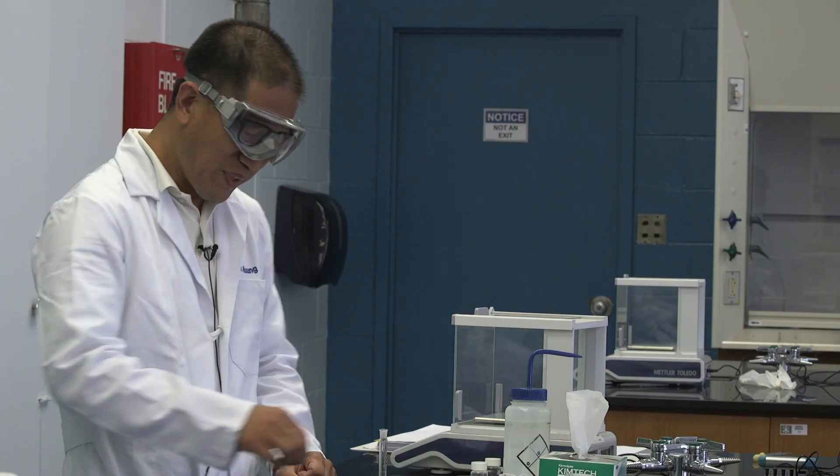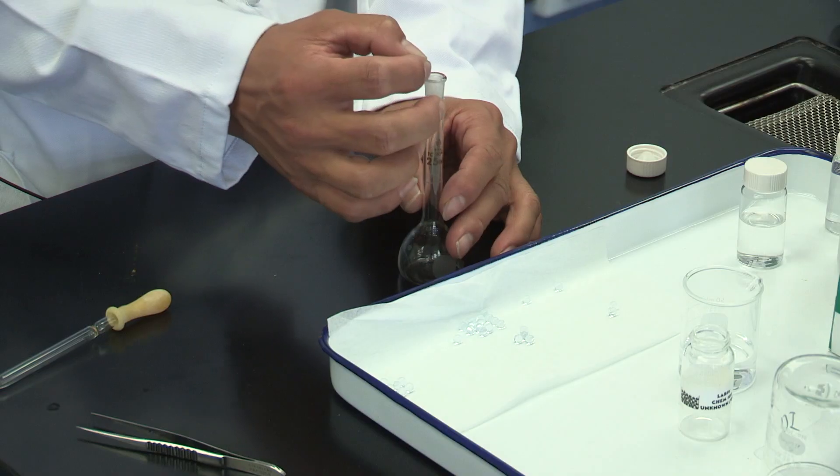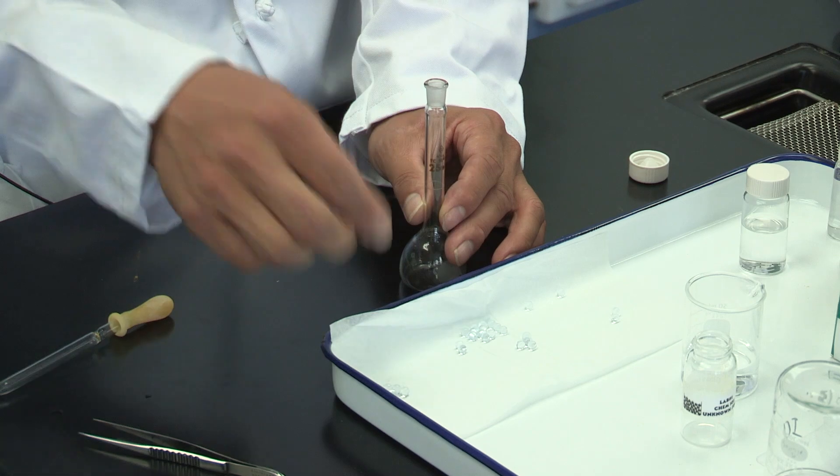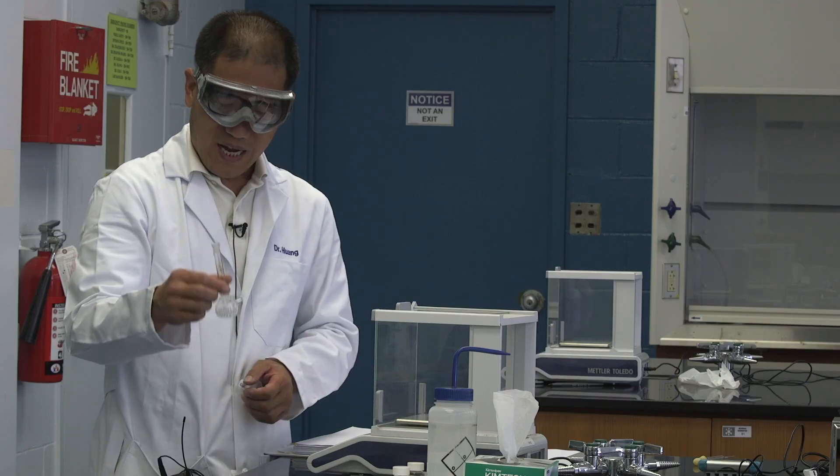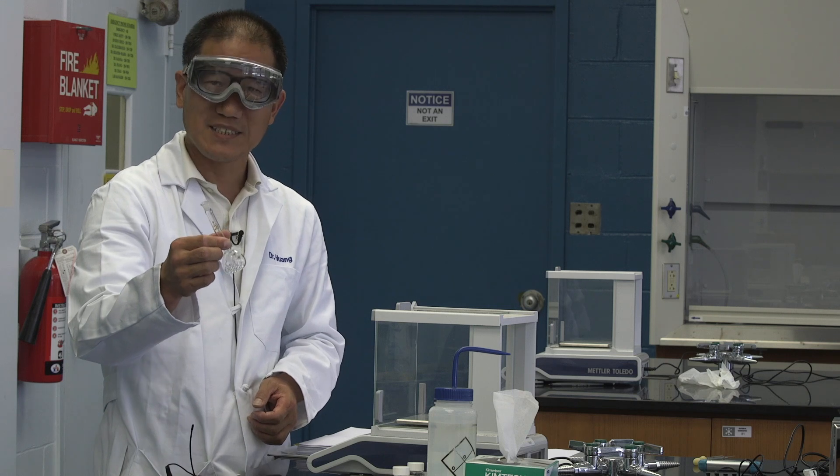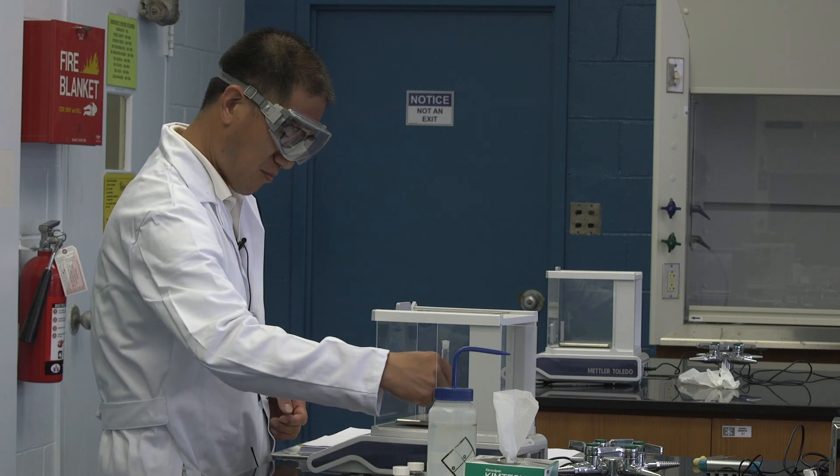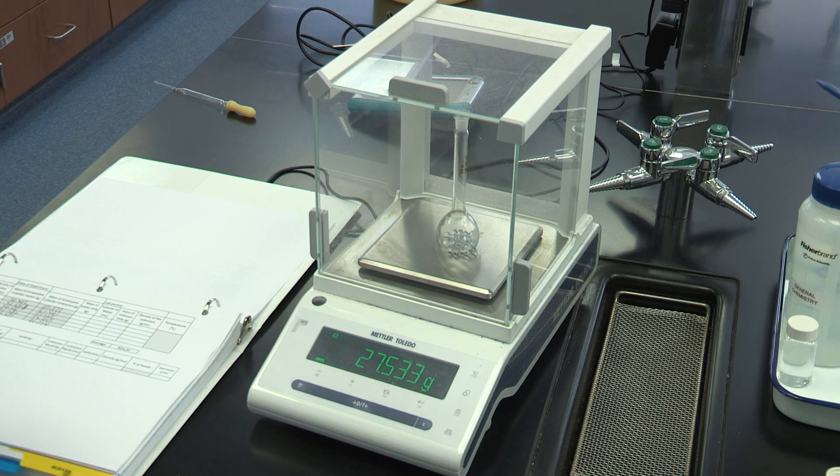Next, let's get the beads into the volumetric flask. One, two, three. I finally get 30 beads inside this flask. I'm going to get the total mass. Follow the instructions I just told you. The total mass is 27.533 grams.